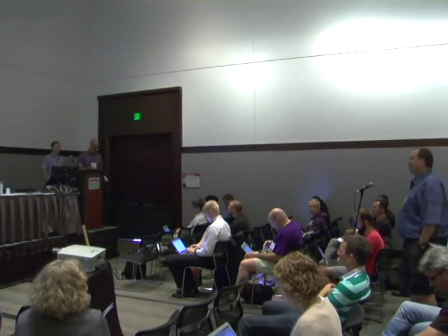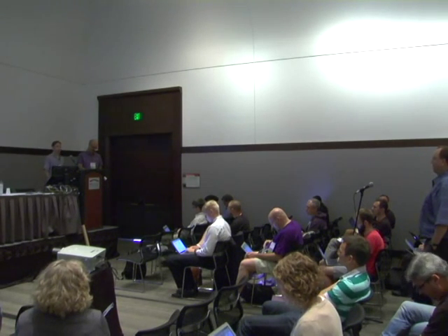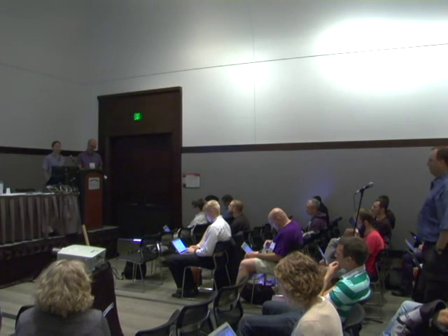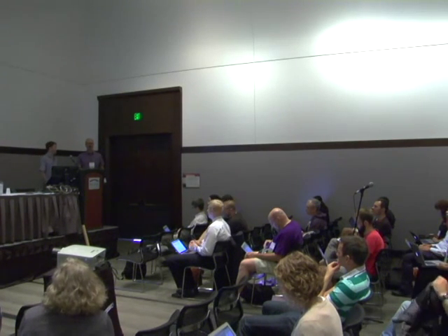For the differential expression step, what tools do you use, or have you implemented your own? We usually use count-based tools, and the tool that we use the most is DESeq. All right, thanks. Thank you. All right, thank you.